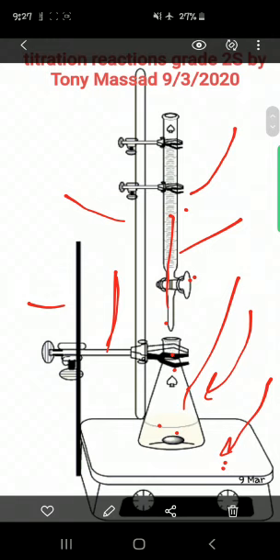How do we observe the equivalence point? The equivalence point is observed when a sudden change takes place, a sudden change in the color, inside the flask or the beaker. For example, potassium permanganate has an incredibly beautiful deep purple color to it. At the point of equivalence, the deep purple color does not disappear. It just turns into a persistent light pink color. At this point, we can declare that the equivalence point has been reached.